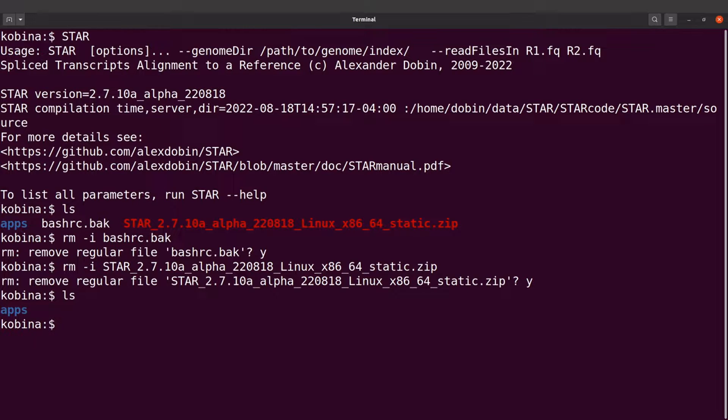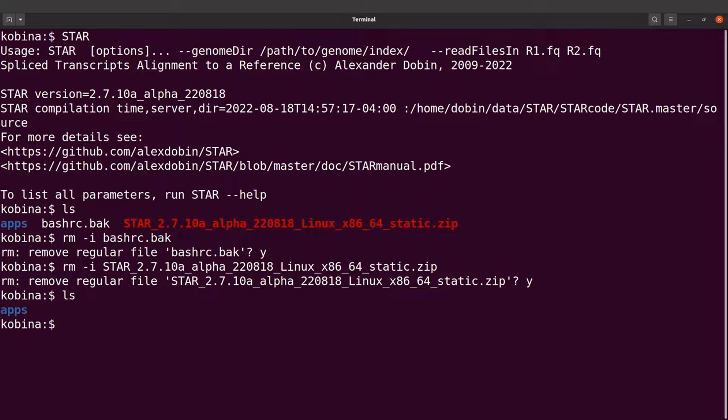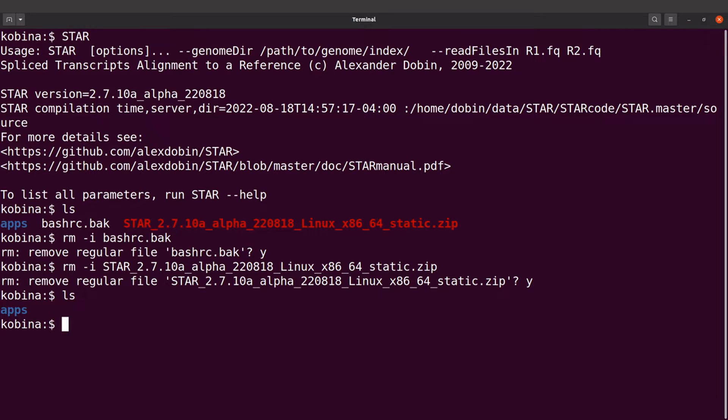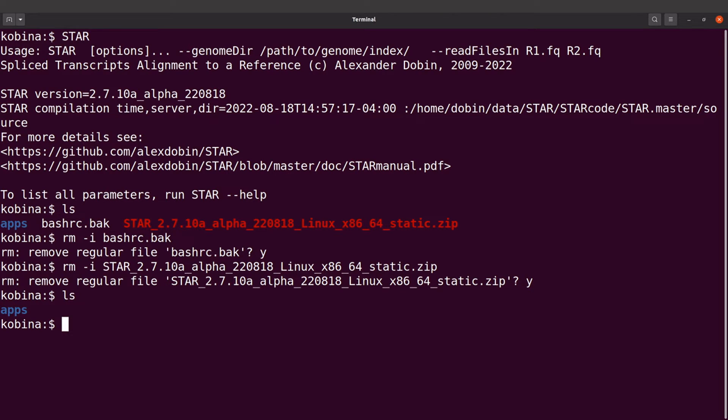I should see only the apps directory there. So that's about it. This is how we set up STAR on a Linux system using the binaries. So now that you are done with this, it's time to watch the other STAR tutorials. There's one that shows you how to map RNA sequences to reference sequence, and there's also another one that shows you how to install STAR by compiling from sources, or another one that shows you how to install STAR using Anaconda. So check all these videos now.